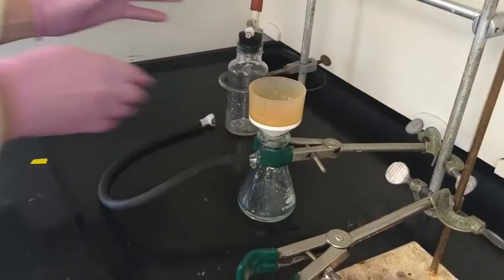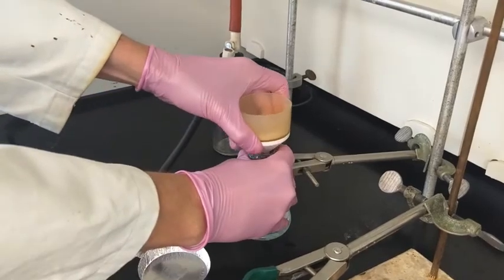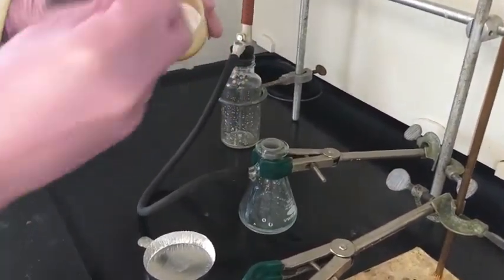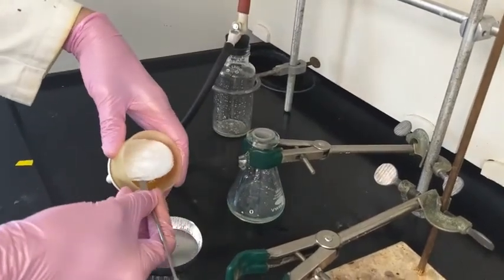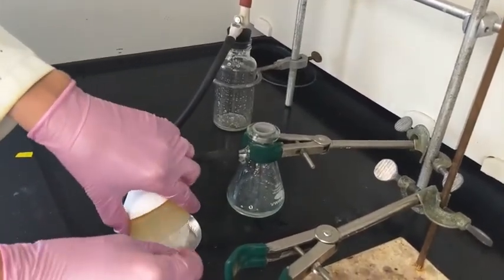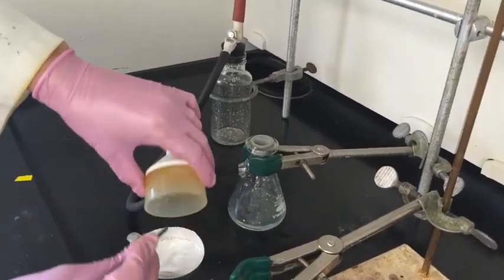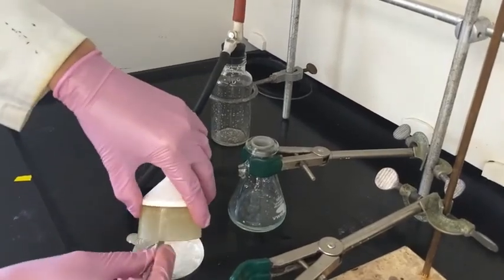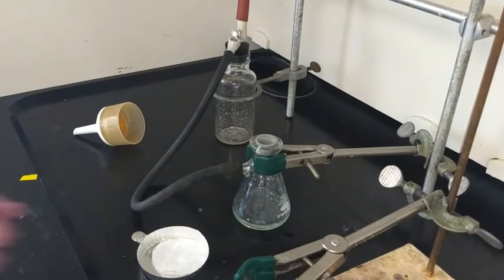Then you'll remove the quick connect to break the vacuum, and you can pull out the filter. Simply sliding a spatula underneath, you can transfer it to an aluminum boat and collect most of the material. In this lab the filtration was out of water, so we'll use the heat vat to further dry it.